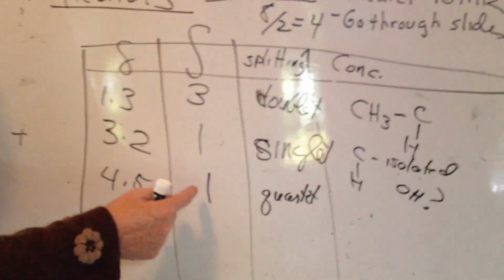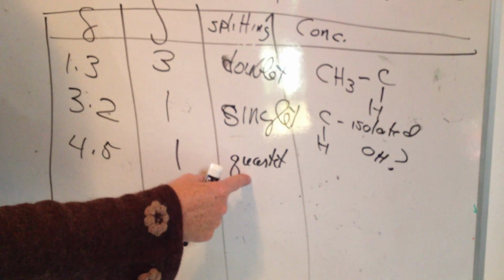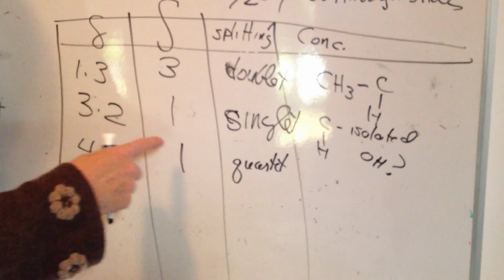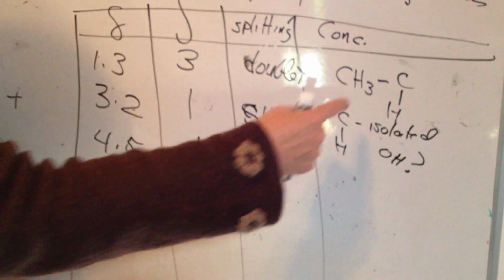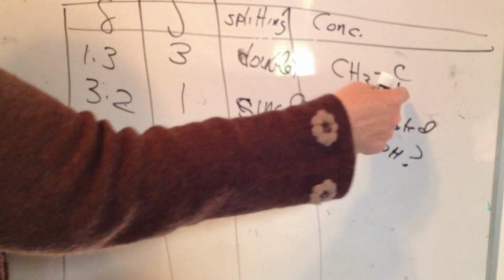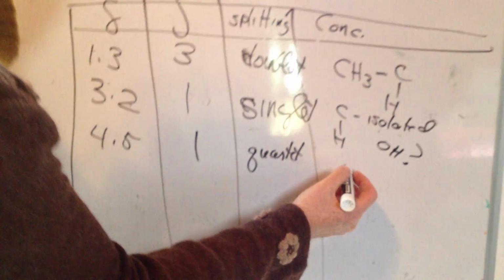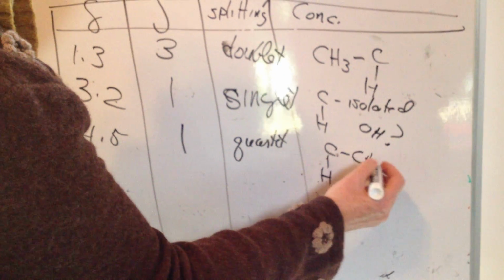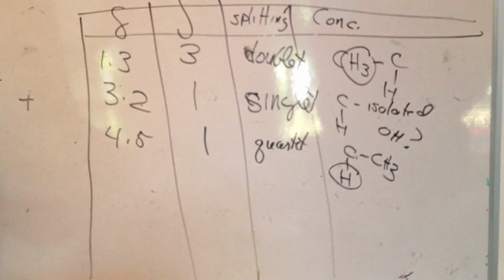This means you are seeing one hydrogen, and it has 3 neighbors. Remember, subtract 1 from the splitting that you're seeing, and that will tell you the number of neighbors. So this is likely a CH next to a CH3, and that's just corroborating this idea. We said we saw a CH3 next to a CH. We should have a CH talking back to the CH3. So this is just verifying that idea. Now the question is, what is that? Is it a CH or an OH?